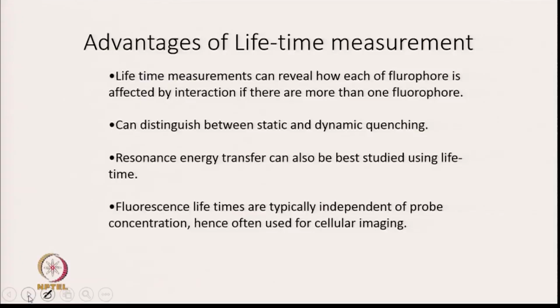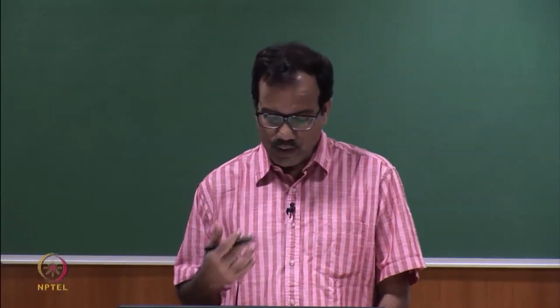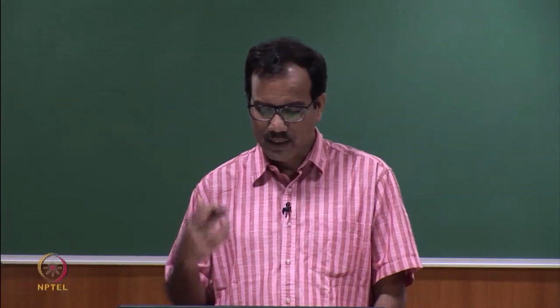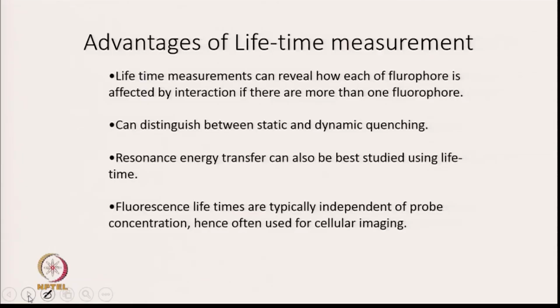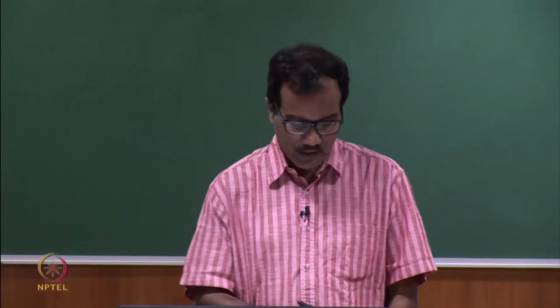The third important thing is that resonance energy transfer can also be best studied using lifetime measurement. Fluorescence lifetime are typically independent of probe concentration, and so they are often used for cellular imaging.